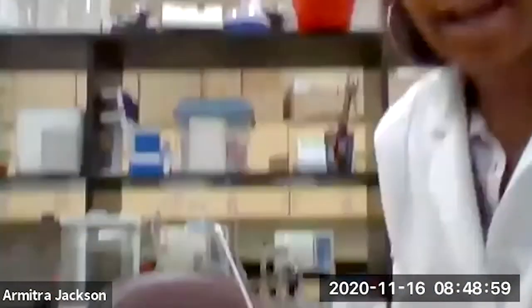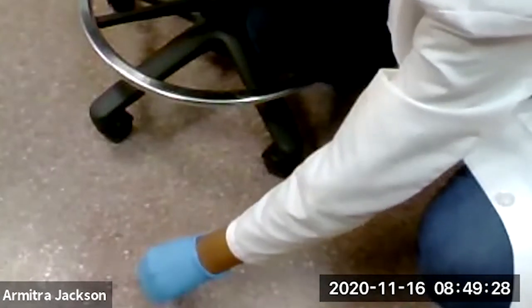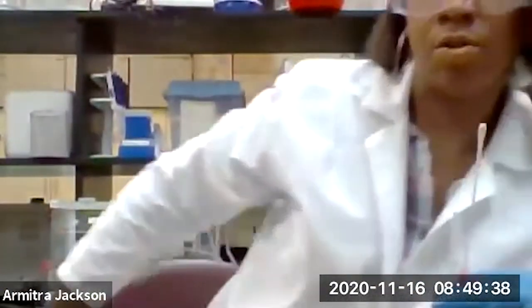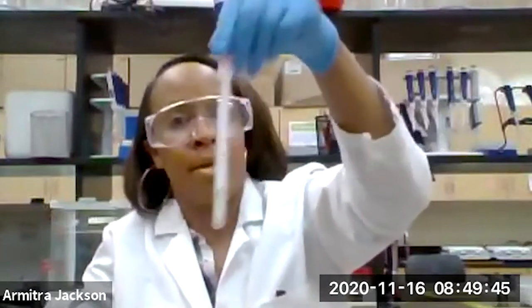We're going to swab that area — that same area where you used the sanitizing wipes. Now we are going to take our swab, get it in there just like we did the first time, and give it a little shake to knock all of those cells off into the media.